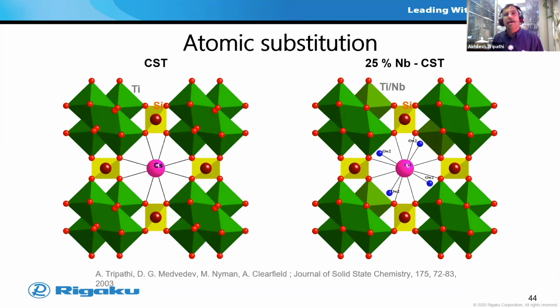And again, by Rietveld refinement, an XRD technique, one could find that once you substitute some of the titanium octahedra by niobium octahedra, the tunnel in which the cesium goes gets slightly larger, allowing the penetration of water molecules that get stuck to cesium. Now cesium is bonded to 12 atoms compared to 8 atoms on the left side. This is what causes the material to hold cesium much better. So all of this can be achieved from the Rietveld analysis technique.